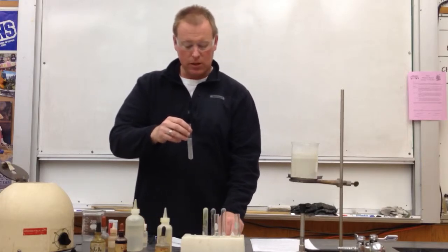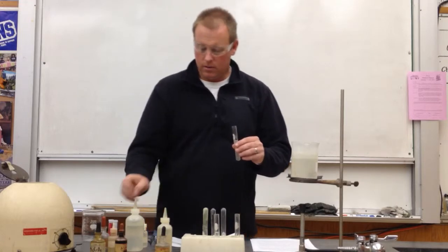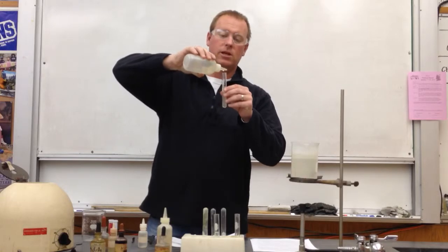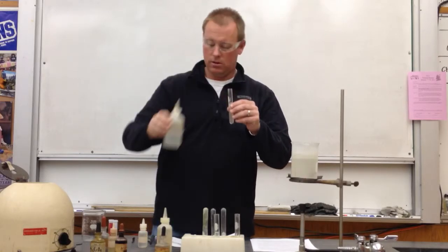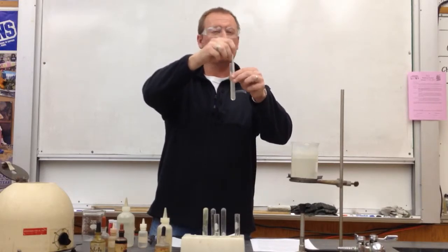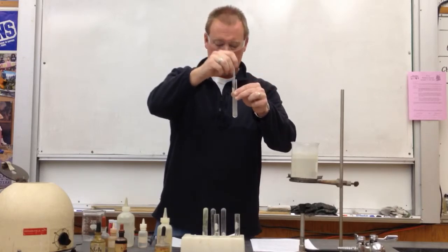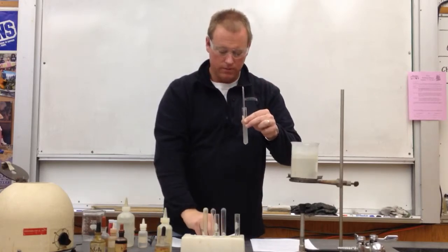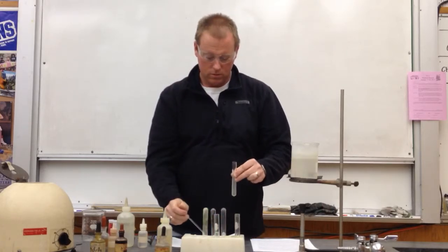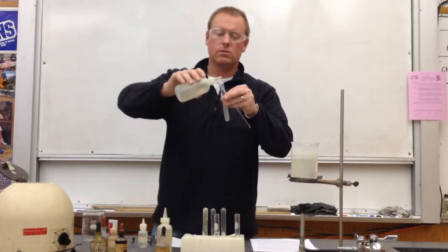So I've got some red litmus paper ready, and I'm just going to leave it here on the paper towel. I'm going to add the ammonia, a few drops at a time. You got to be really careful here. The precipitate that you're looking for may disappear completely if you make it too basic, and there's really no way to get it to come back, so you've got to be patient here. Alright, red paper, still red. Let's add a couple more drops.